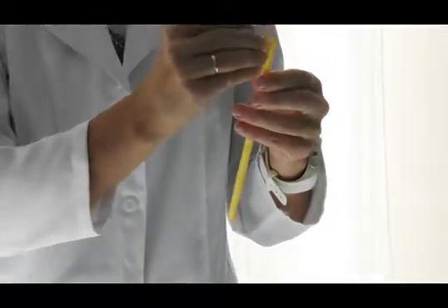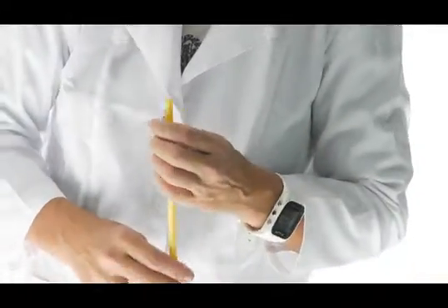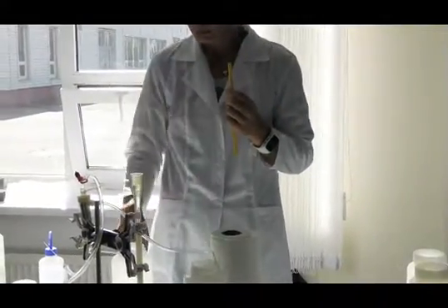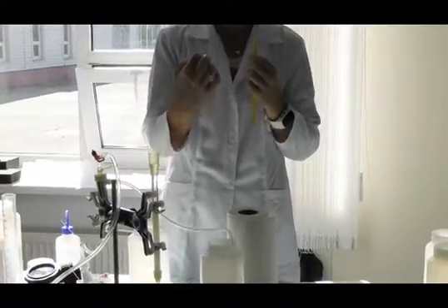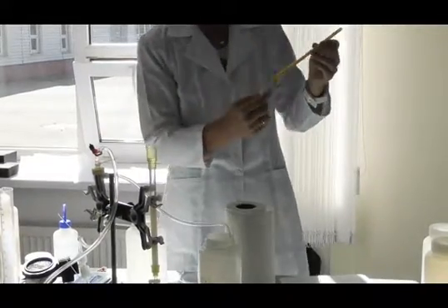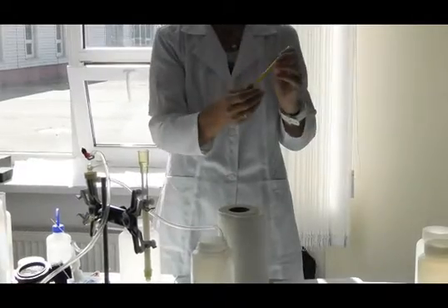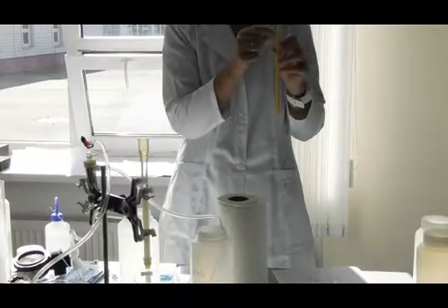The advantage of this filter compared to other ultrafilters, where you press the whole sample through, like you do with the 0.45, or use centrifugation forces to press the sample through a membrane, is that in this case the whole sample goes through the big hole of the tube, and the filtrated water goes through these small holes in the tubes.